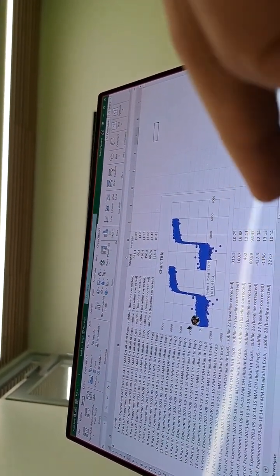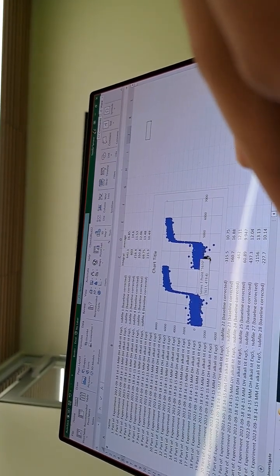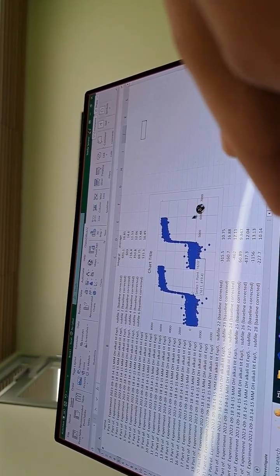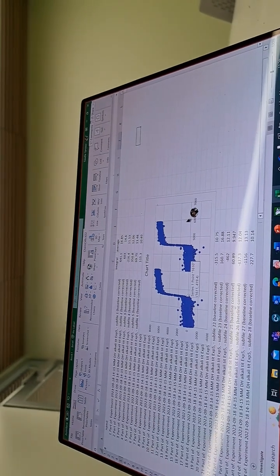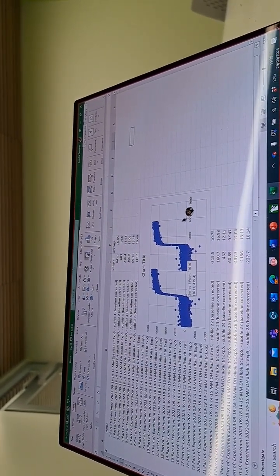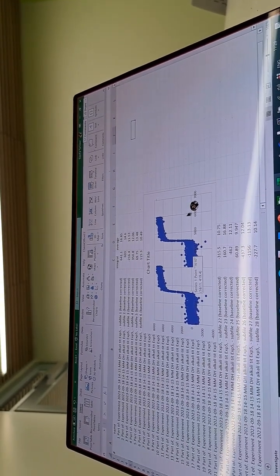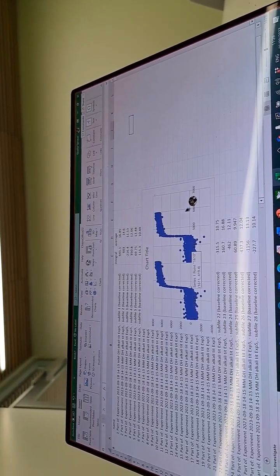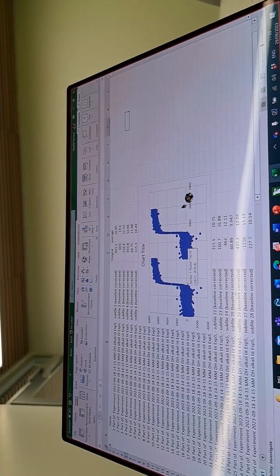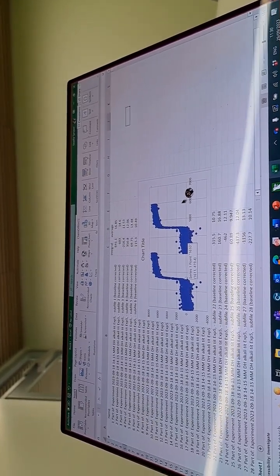Here we are. This plot is area as a function of the number of the peaks. Because then they said to plot peak area as a function of time, and peak area versus the pH, to see how that changes.